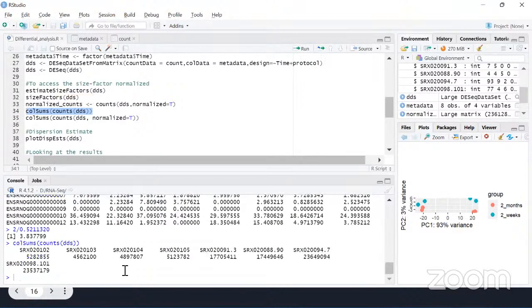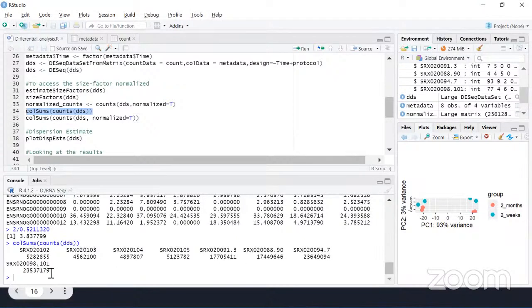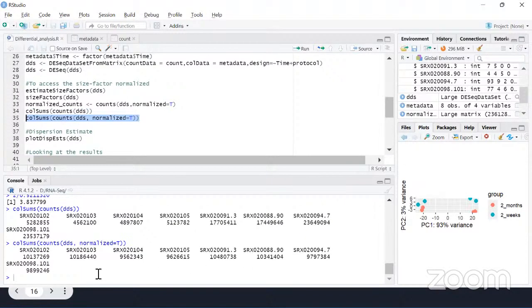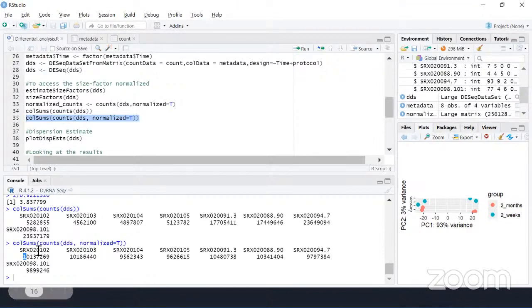Looking at column sums, we can see the raw counts vary greatly — some samples have around 4–5 million reads while others have around 23 million reads. After normalization, the column sums become comparable across samples — around 9–10 million reads each. This is the main reason we do normalization: to make counts comparable across samples with different library sizes.